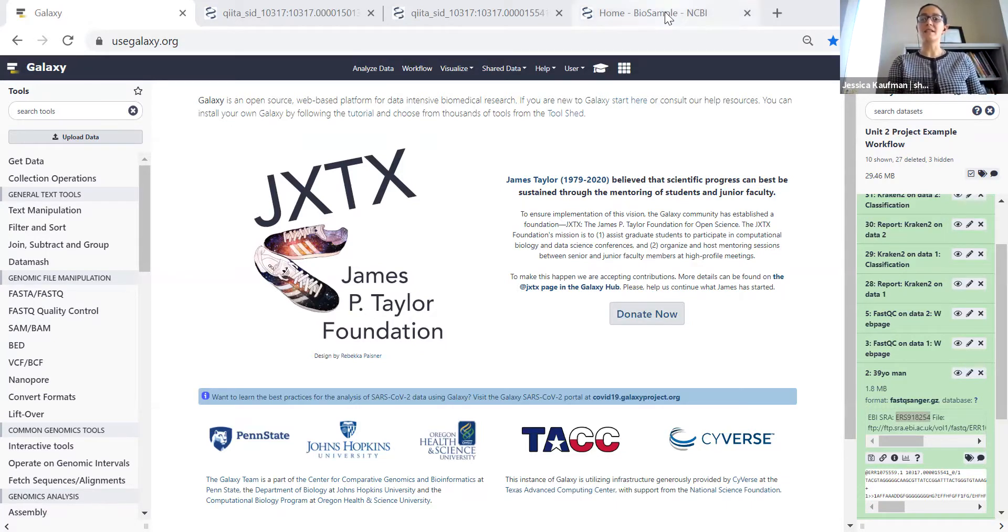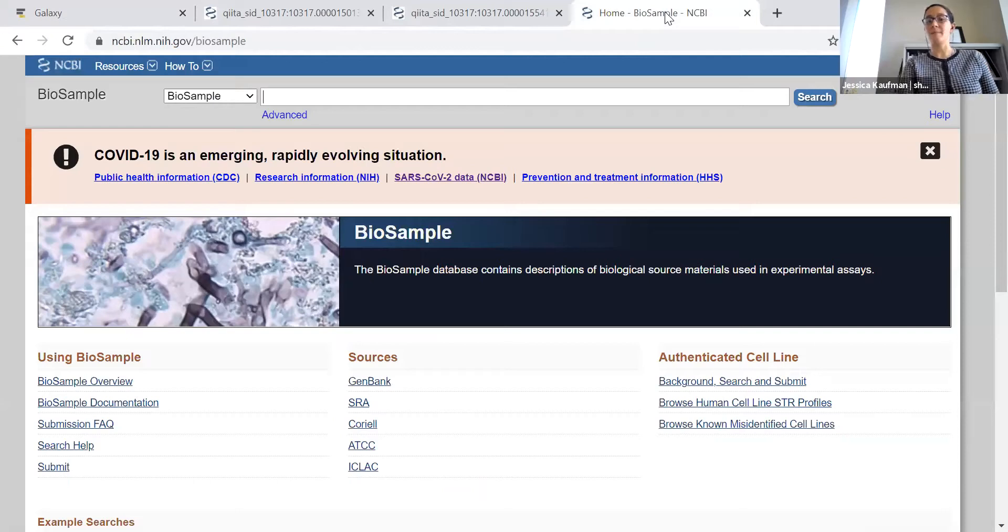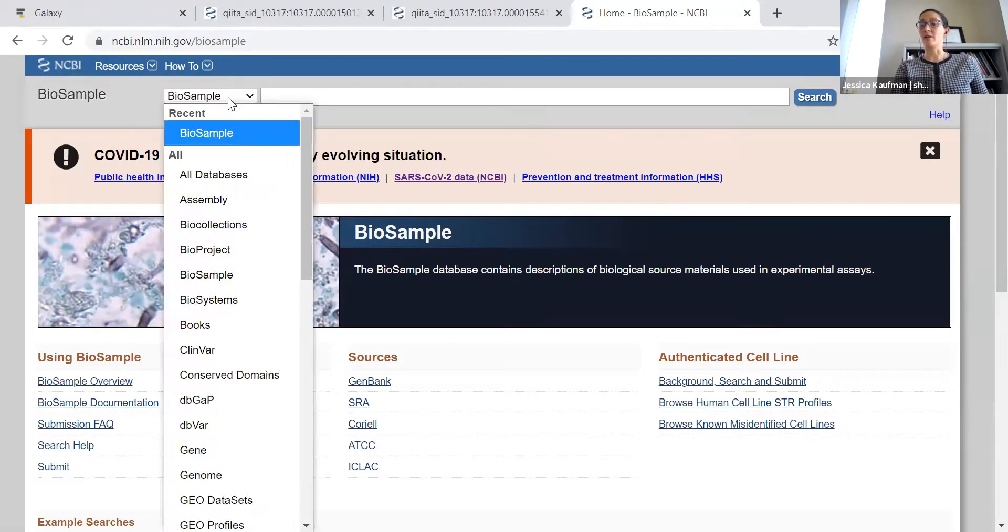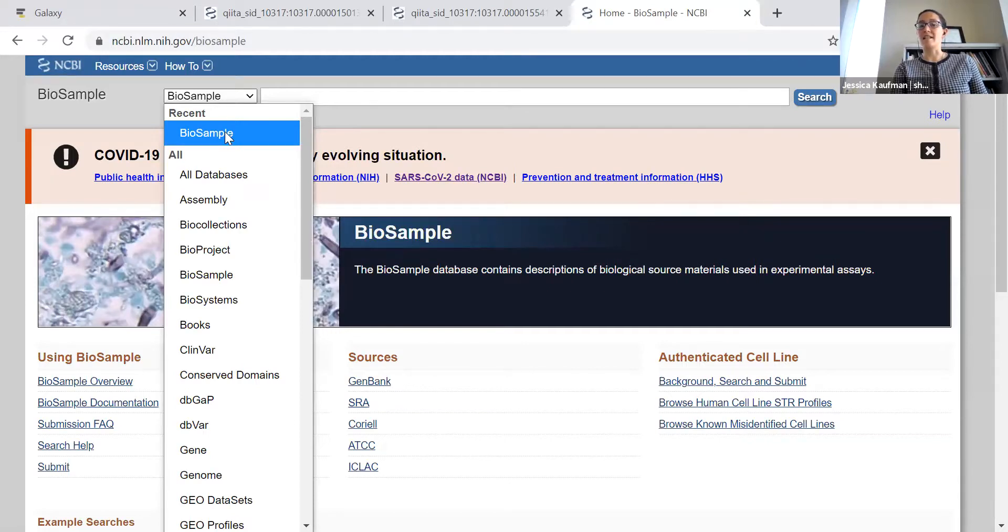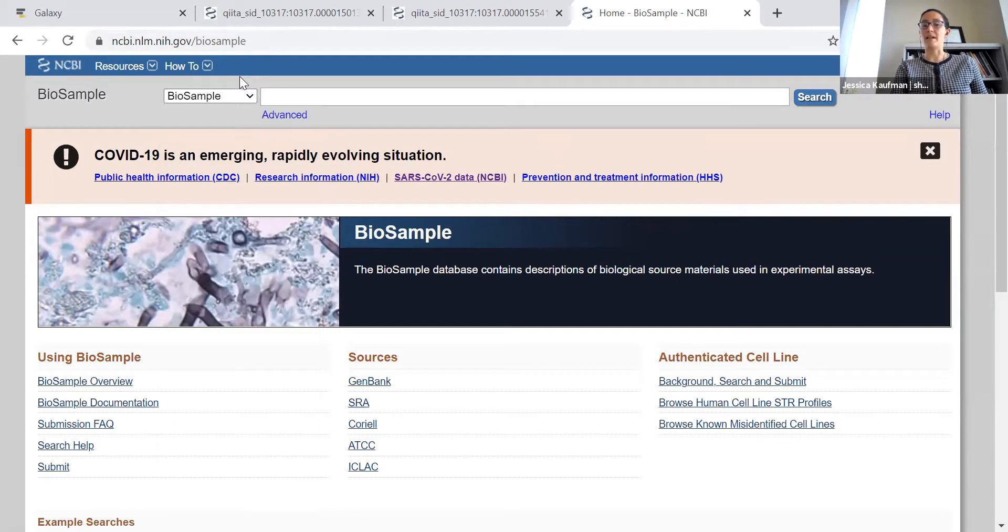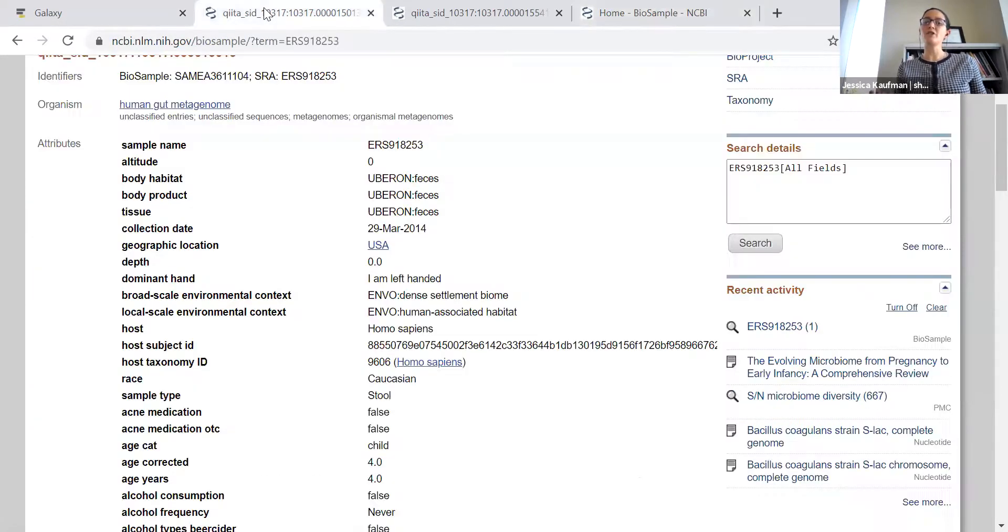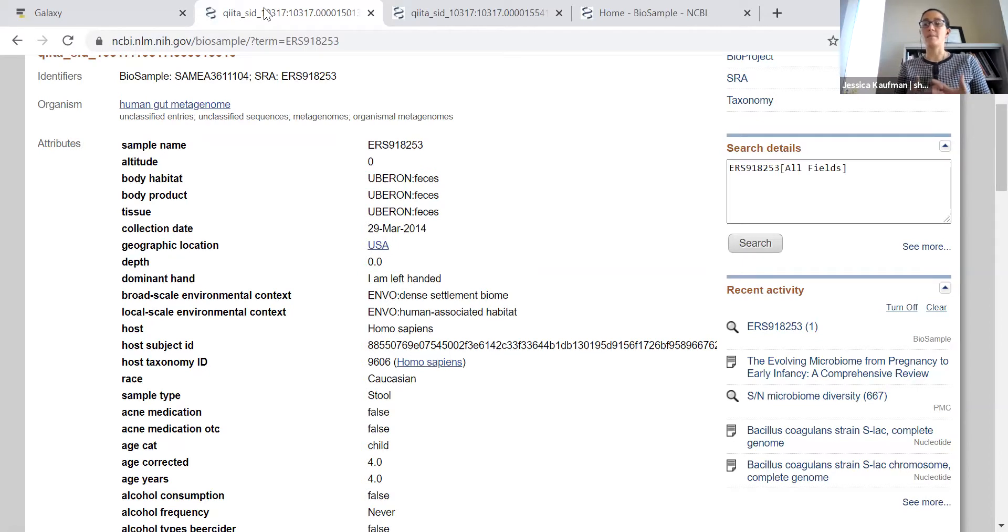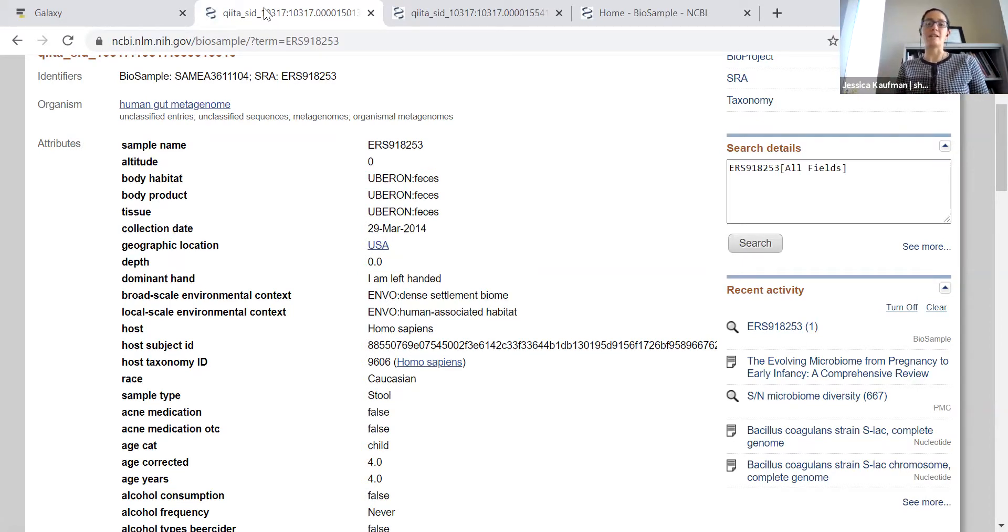The website is called NCBI BioSample. Just like other NCBI resources, you can go to the NCBI homepage and select BioSample from the pull-down menu. I want to show you the two samples I selected. You can see some of the survey questions that are asked when people submit a stool sample to the American Gut Project.